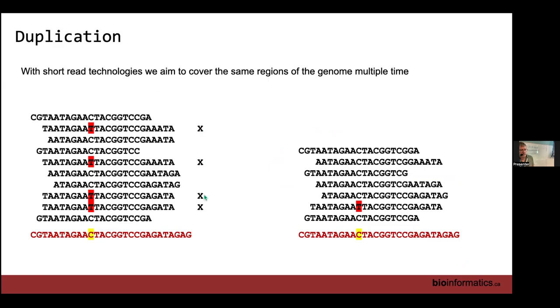And just to emphasize the issue, what I've done here is I've marked several reads as being duplicates. This is what we will do with some of our software. If we look at the original data, we see about a 50% representation of this single base mutation here from a C to a T. Once we've marked those reads as duplicates and cleaned it up, we see that it only happens once. Maybe it's more likely to be a sequencing error than anything else, that somehow got amplified with multiple reads and represented more than we want.